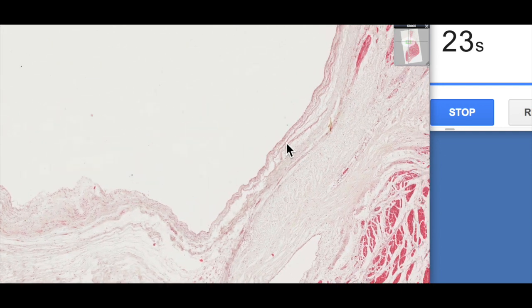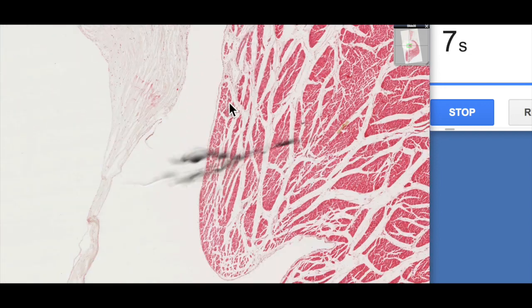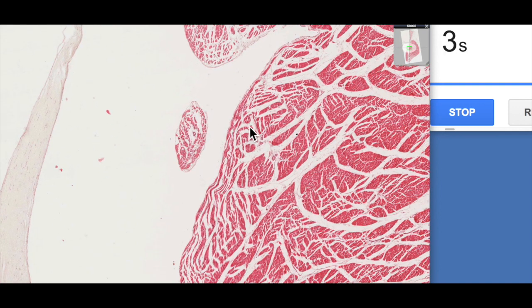If we follow the atrial side along we can see that it's really an extension of this thick endocardial layer which we have here. If you were to see a gross specimen of the heart, that's really reflected in the structure. The atria often has a very wide appearance to its surface compared to the ventricle, which doesn't have that thick layer of endocardium.